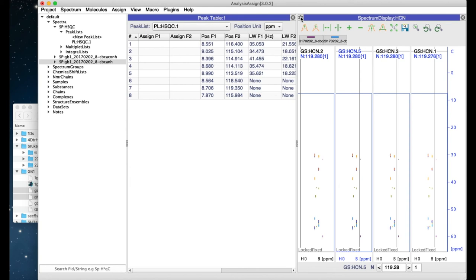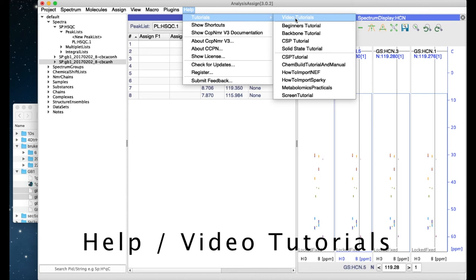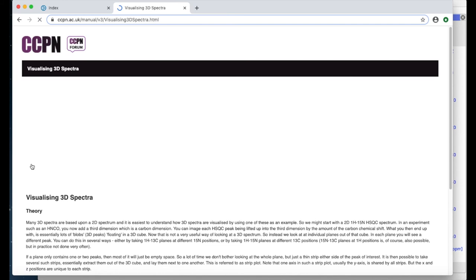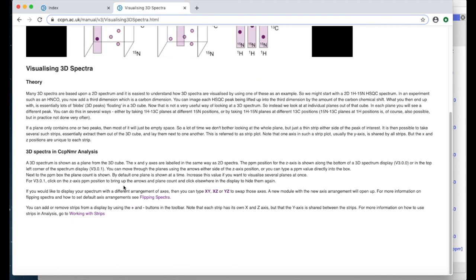In the Help menu we've got links to a set of video tutorials and a kind of manual. This covers a variety of different topics and if you click on one of these pages they will generally have a YouTube video at the top and some text below, so it's up to you whether you prefer watching videos or reading through some text.